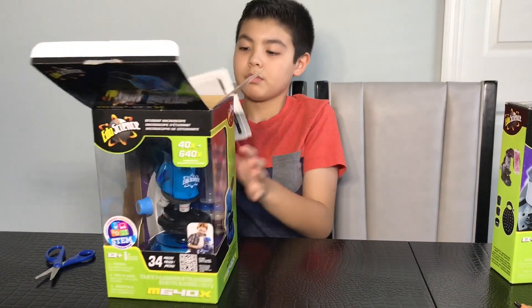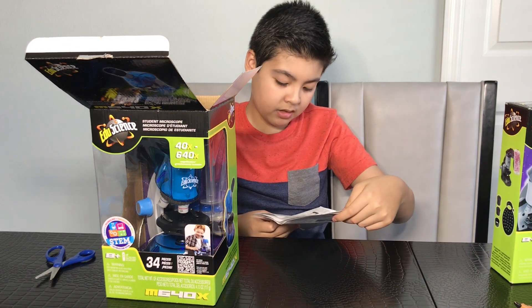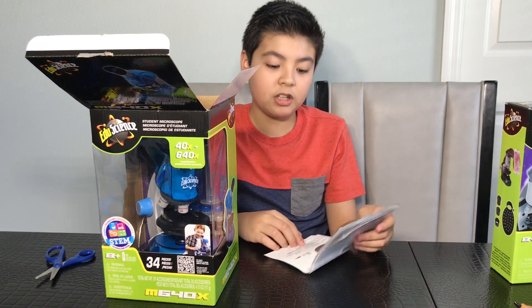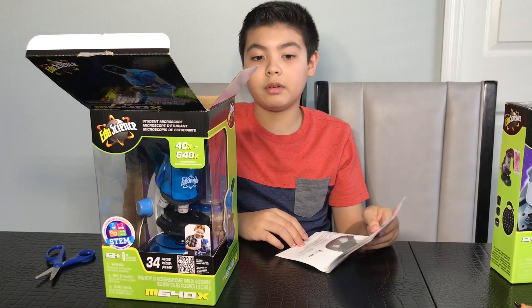We have a manual. Looking at the manual, the microscope is here. We need two AA batteries and they're not included. So when you buy this, get your two AA batteries.